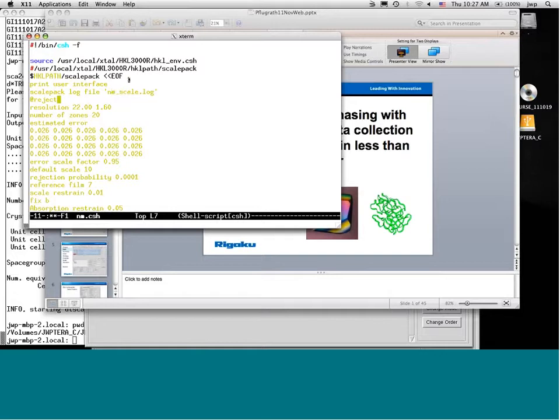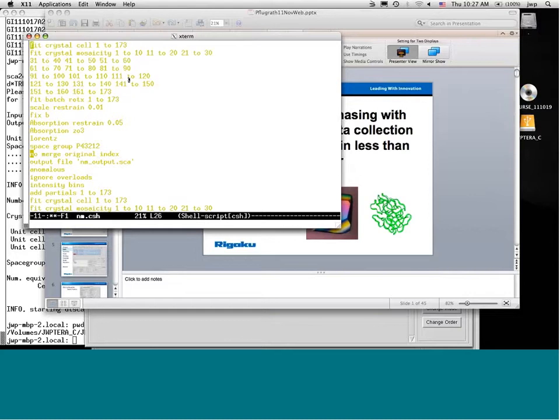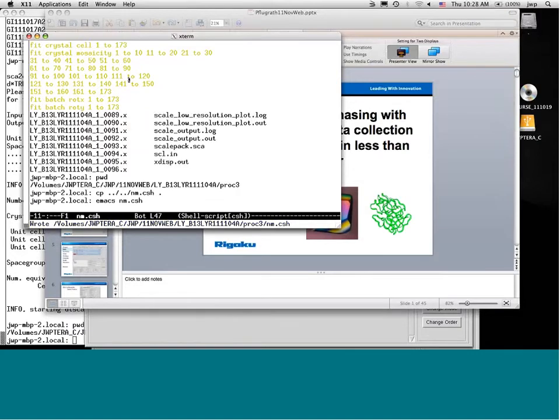the script. And I'm going to make a no merge output file here. This may be confusing to you, but you'll see in a moment what's happening. And I'm putting it in this webinar so that it's here for posterity and future training. So I'm adding the command no merge original index. Other than that, nothing is really changing. And I'm just deleting the comments I had in that.